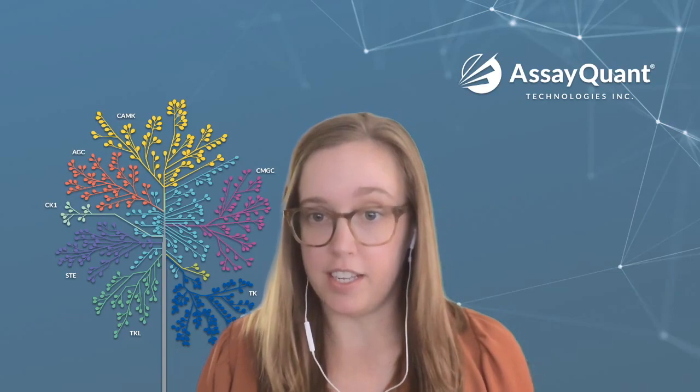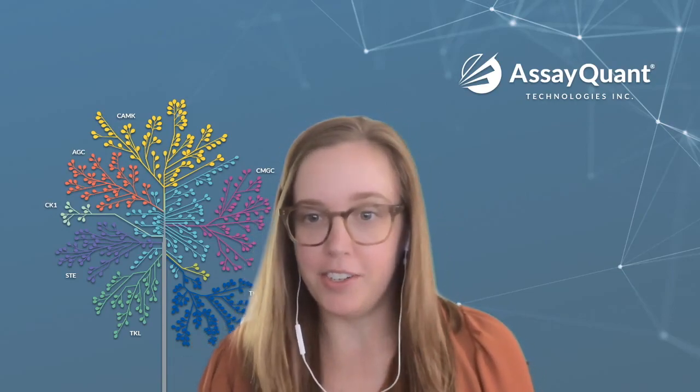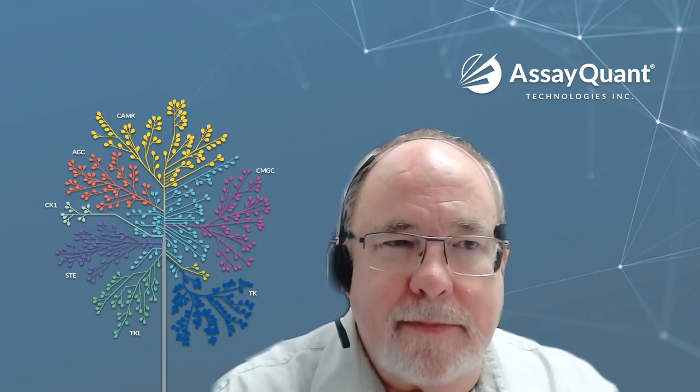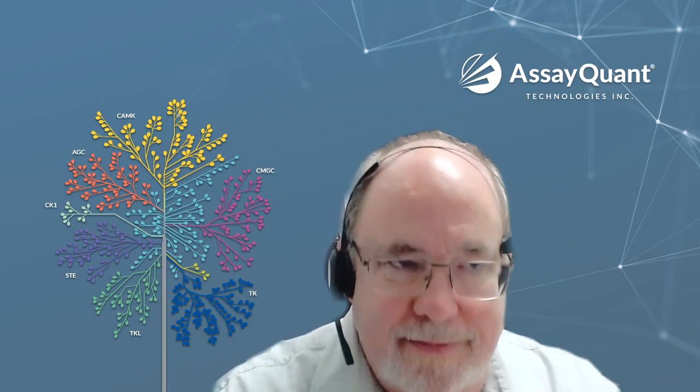All right, this question is probably for Earl. For your kinome profiling work, you use some seemingly unique concentrations of each EGFR inhibitor. Can you talk more about one, what inhibitor concentrations you would typically use for an NCE, and two, if you recommend performing the experiment at 2 different ATP concentrations, as we showed?